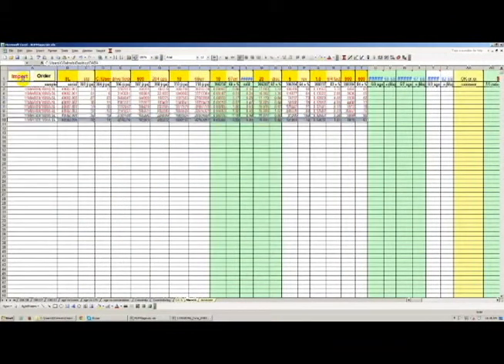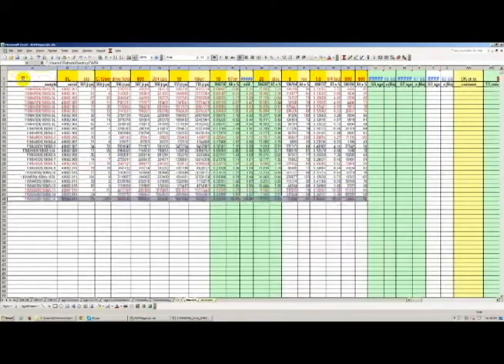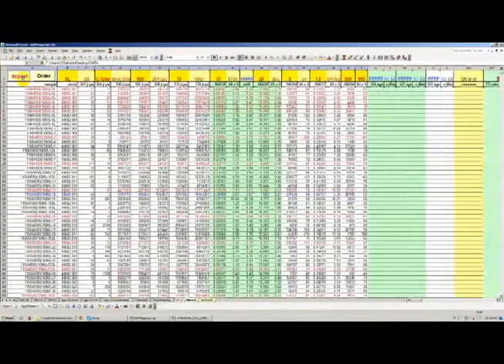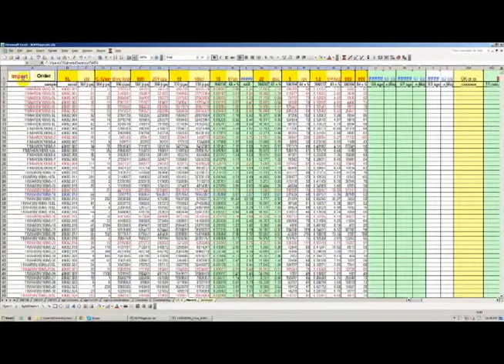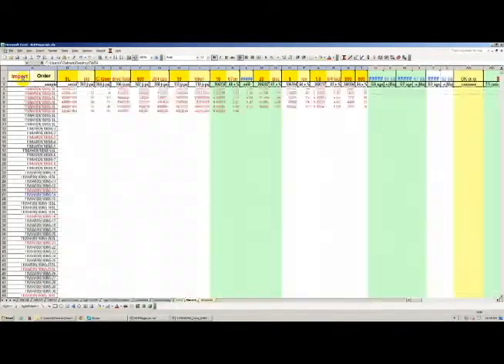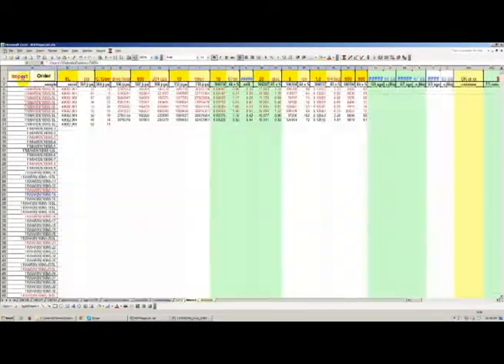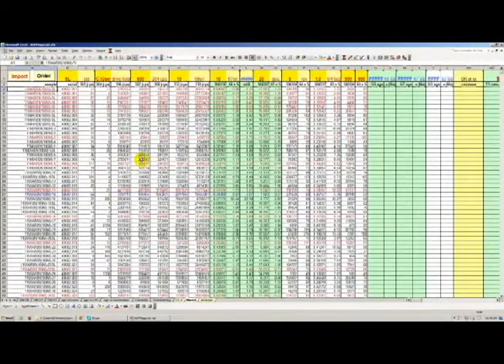What the program is doing right now is going down that txt file, going spot by spot, and doing the down-pit fractionation correction of each one of these points by performing a least squares regression through the acquired data. Once it's done, it's going to take about 30 seconds for the trial sample to import all the 100-something spots that you've analyzed.